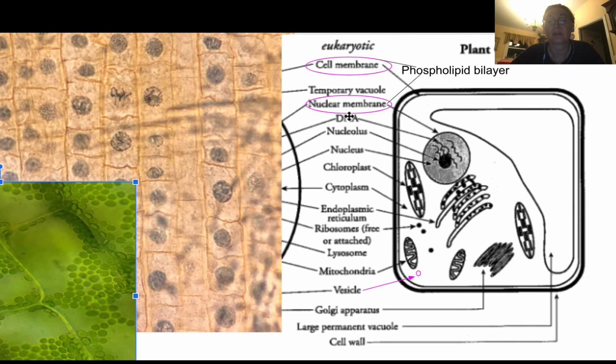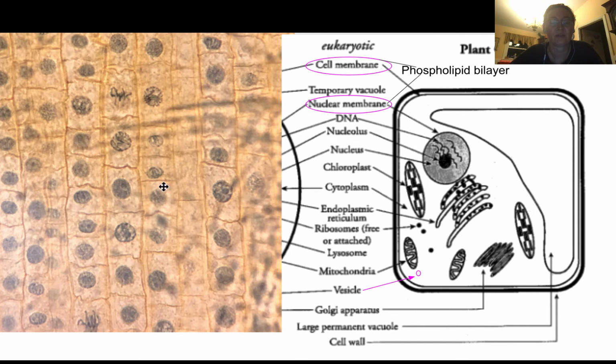All right, and DNA. Well, we actually can see DNA. That's the stuff, as you know, that's inside the nucleus. DNA is in the nucleus, but we can even see some kind of shape and structure to that DNA. If we look at these onion root tip cells, we notice that the nuclei don't all look alike, right? This one here doesn't even seem to have a membrane around it. It looks like someone dropped a pile of hot dogs on the floor. This one looks like an earthworm family trying to escape a house on fire. I don't know. They don't look the same as these other nuclei.